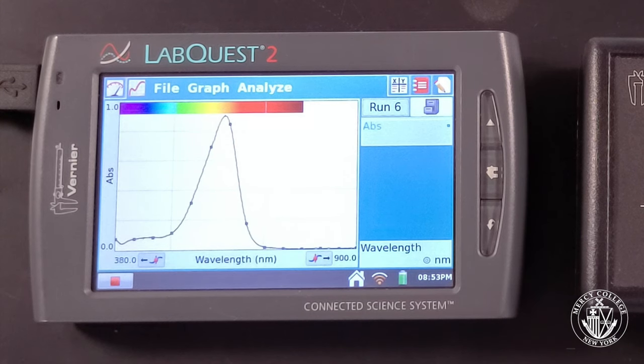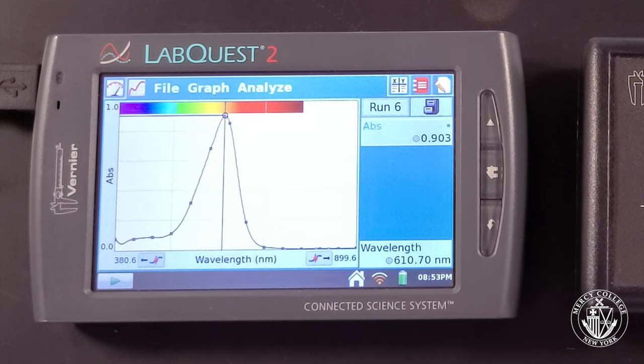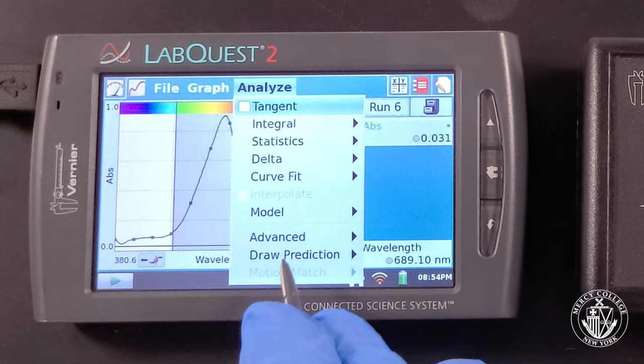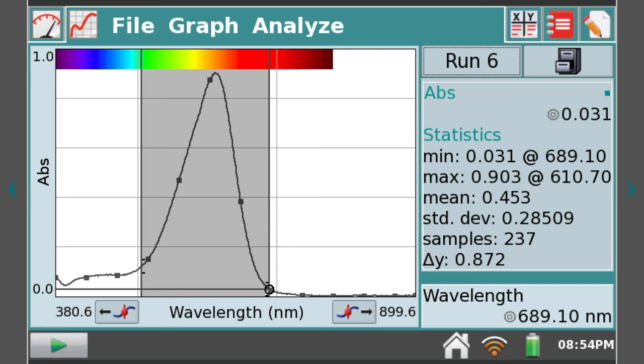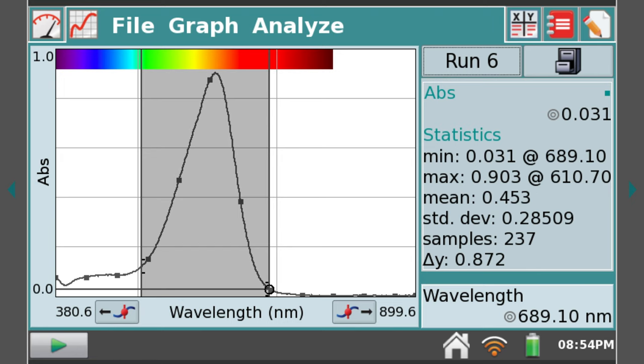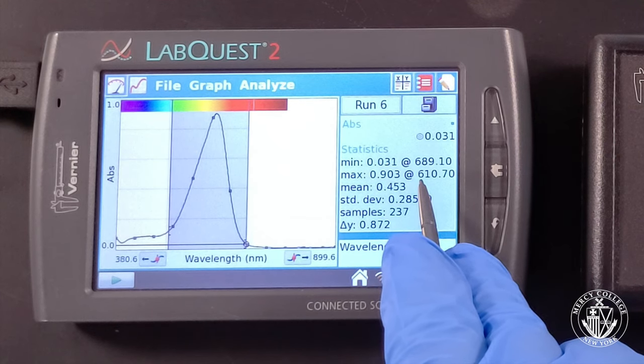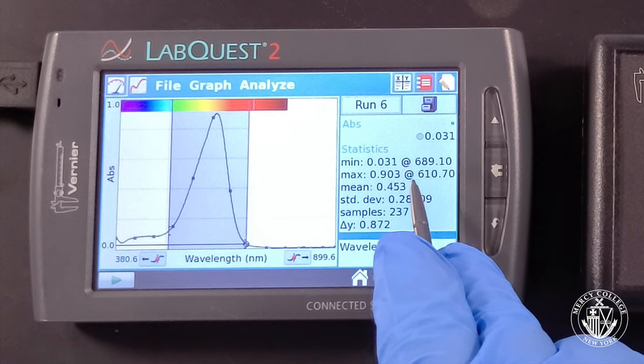Our last dye sample also appears to absorb in the yellow-orange region of the spectrum. It appears to have a maximum absorbance of 0.903 at a wavelength of 610.7 nanometers.